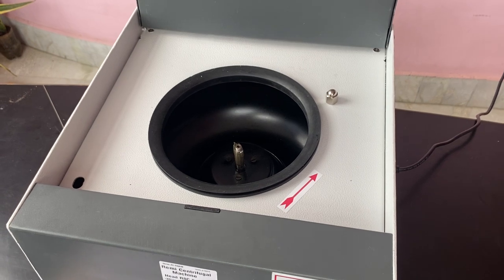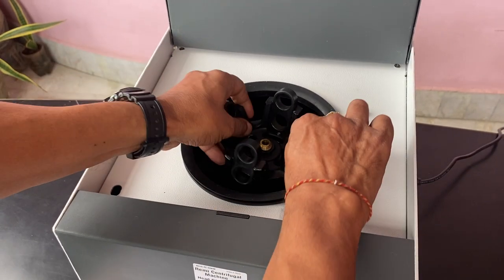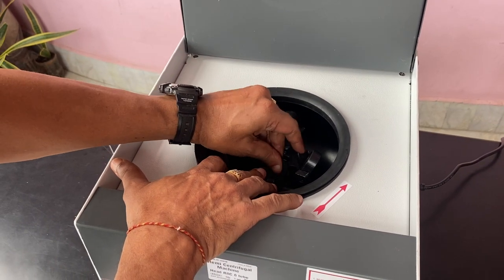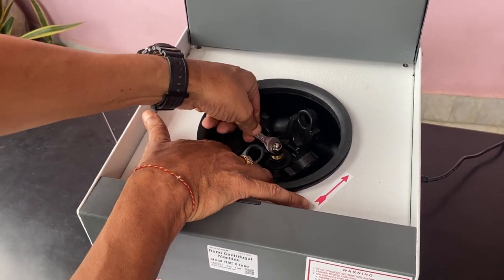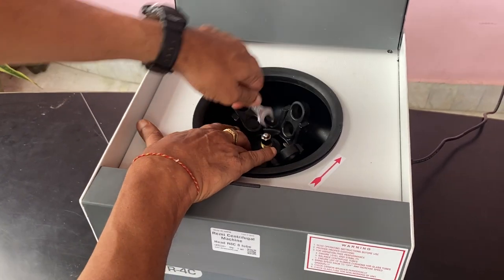You have to open the center pillar screw. These are the tools provided — one key and another is a lock. Here is the top side. Press it and screw the knob here. Fix it and tighten it with the key provided.